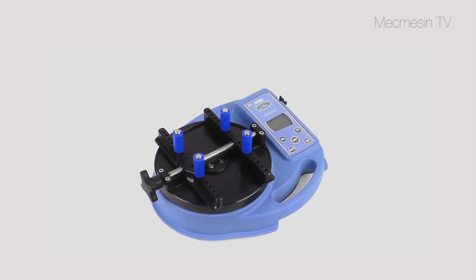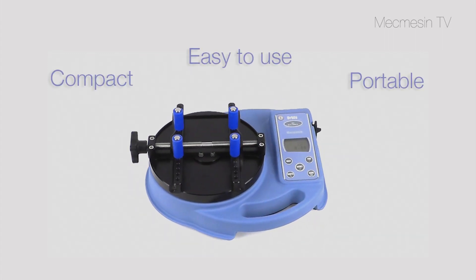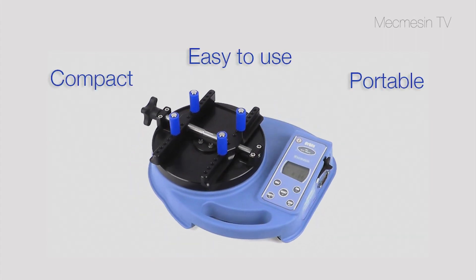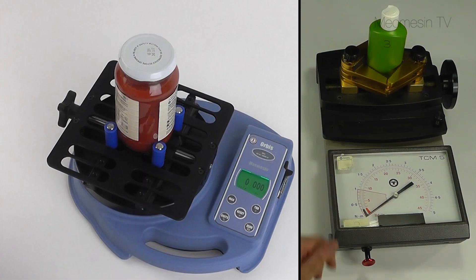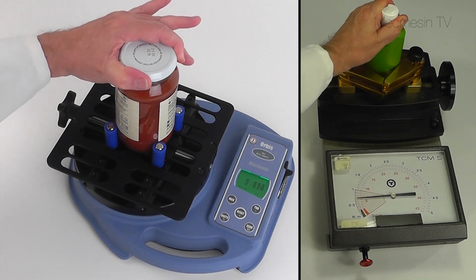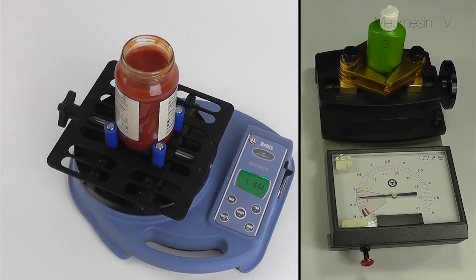The Orbis is a compact, portable torque tester, ideally suited for testing a wide range of closures and many other applications where accurate measurements are required. It provides a far greater level of accuracy compared to other forms of torque measurement.